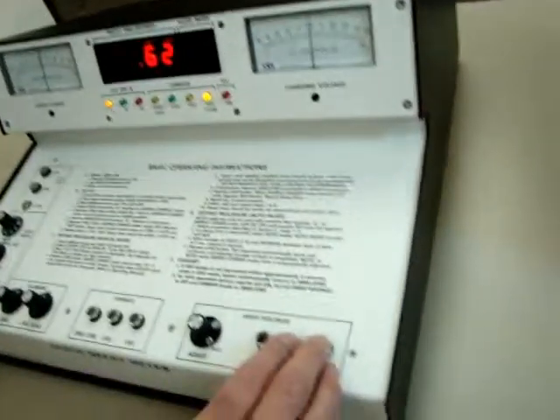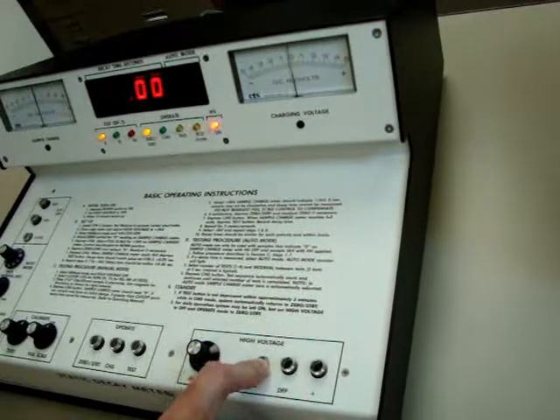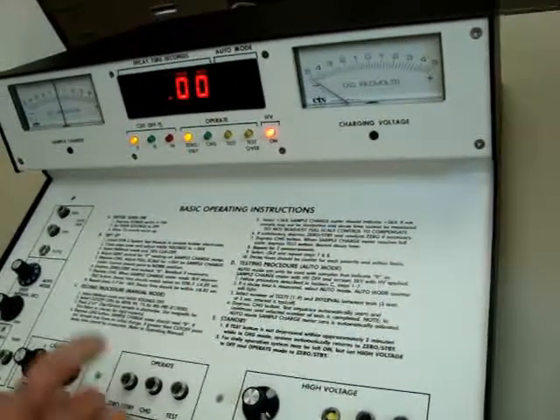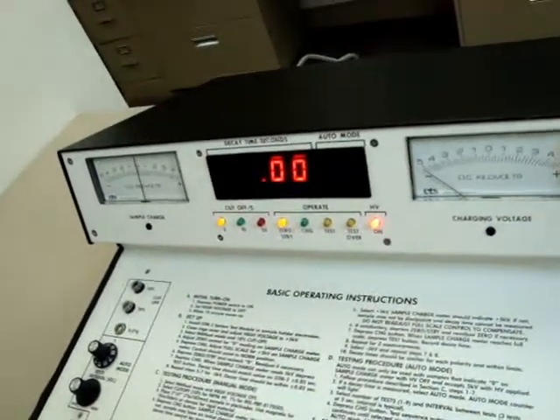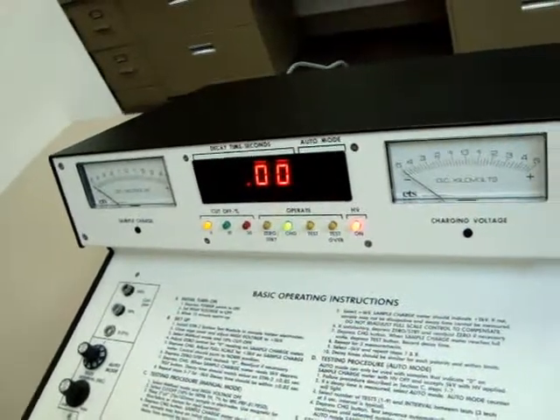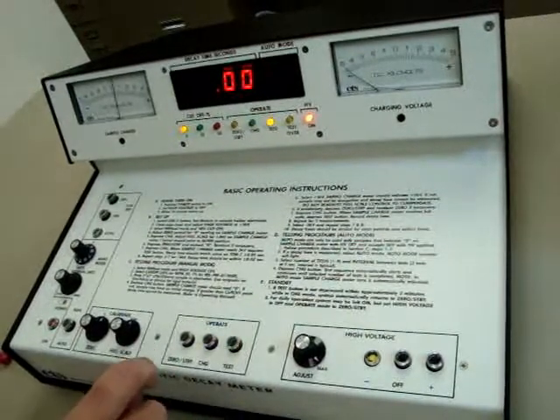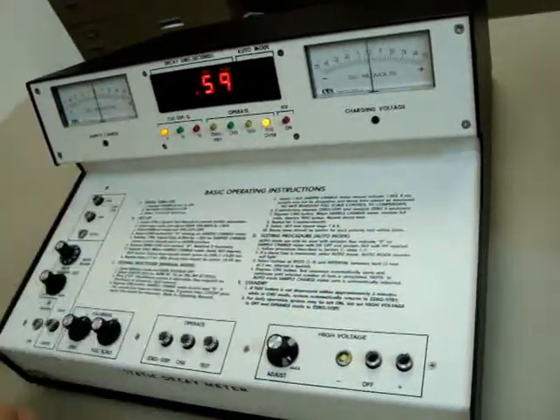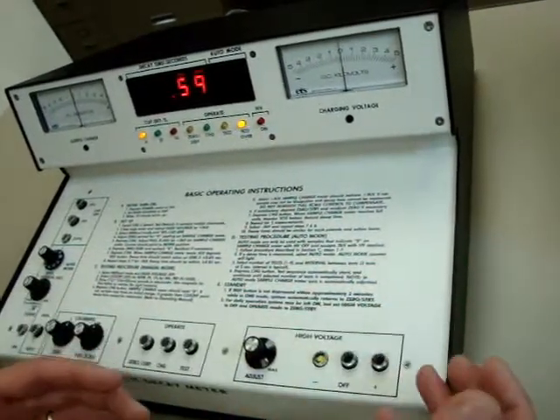Now, to show you the negative side, we turn the high voltage off and turn the negative high voltage on. Again, make sure we're in zero standby with the sample charge meter at zero. We hit charge — it reads about 5 kV — and we hit test. Notice this LED comes on first, and we're reading 0.59 seconds on this side. So the negative side is reading about the same as the positive side.